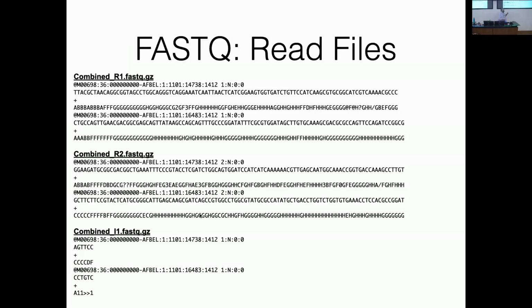So Illumina calls each of those zones a tile, and it has a number assigned to the tiles. It's not that there are 1,101 tiles on this flow cell, but that's just how they have them numbered. I think this is actually the first tile on the flow cell.